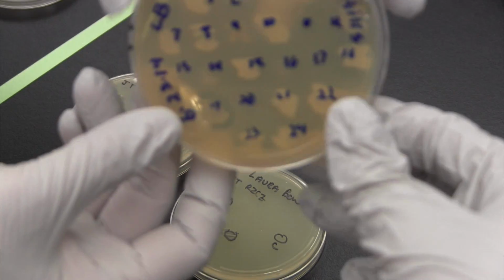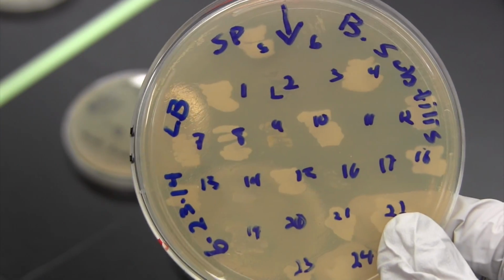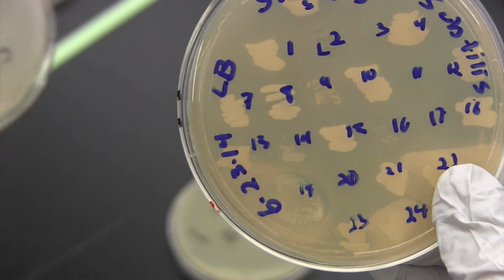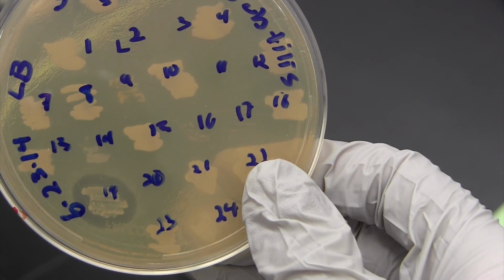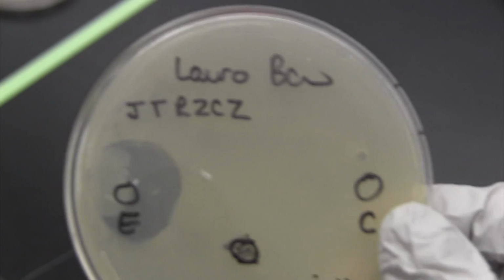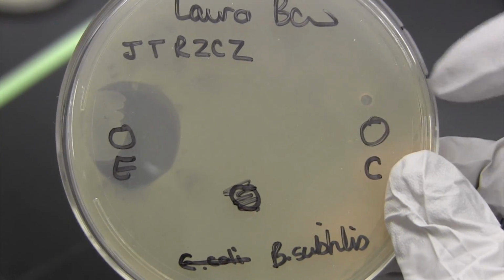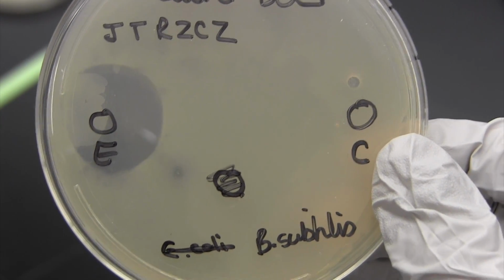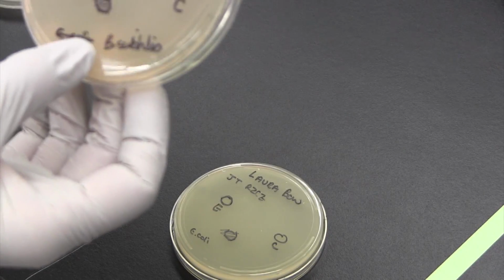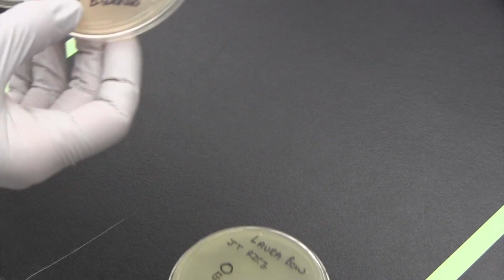So this is just reminding you of a streak plate, and this is showing you that this isolate here had activity against B. subtilis. So this is the isolate that was then brought forward, and we did our chemical extract, and you can see really clearly that against the lawn of B. subtilis, there's a beautiful clear zone of inhibition where our chemical extract was added, and there's obviously not any negative effect of our control. So this is an example where the activity is mirrored in this assay, as you saw in your spread plate.